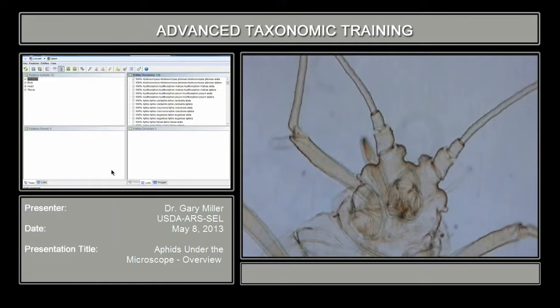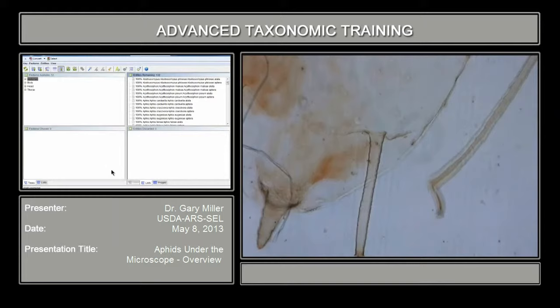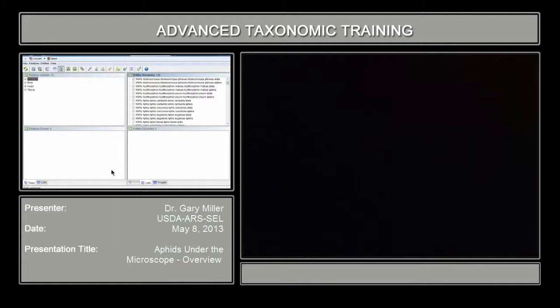If you can remember what we looked at with Aphis gossypii, you can see that in this case Myzus persicae — the green peach aphid — while aphid-like obviously, scrolling down here we have the siphunculi and the cauda, but you'll see some differences in the structures in the head region. Most notably are those frontal tubercles — I'm going to zoom in to get a better look at those.